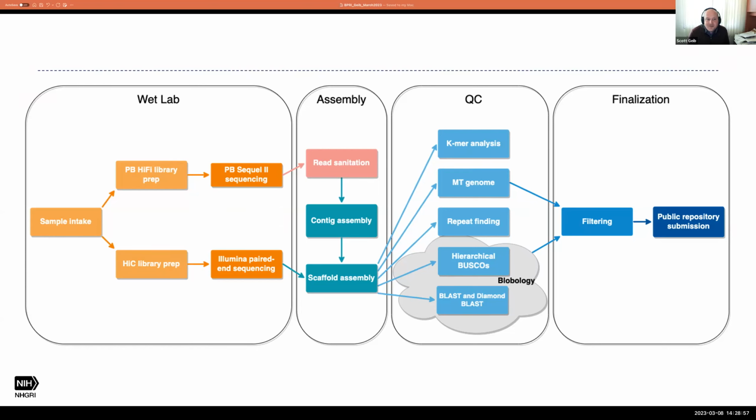You do get a little loss, and it's not as simple as indexing in Illumina sequencing, because with Illumina, all your libraries are the exact same size. Let's say you made a 300 base pair library, a 400 base pair library. Here, your libraries could be of different sizes because of different qualities, different shearing parameters. So if you're trying to do equal molar pooling, it can be very hard to dial in equal molar pooling on things that are like shear smears, right? So they say these things, but in practice, I still would probably just sequence one bee, one cell, because the price of the cell is cheap enough that we can afford that. But you might get something that is not completely even between all your samples.